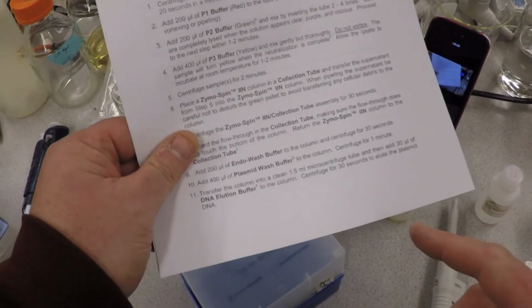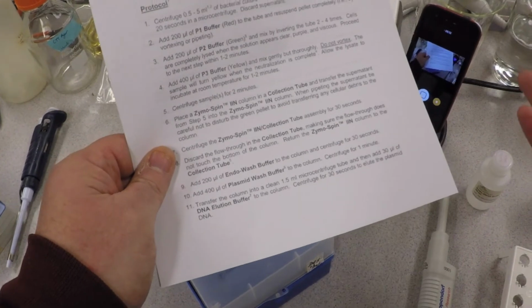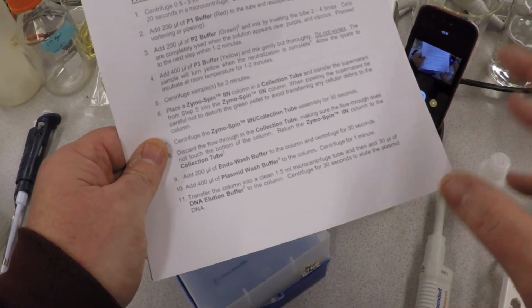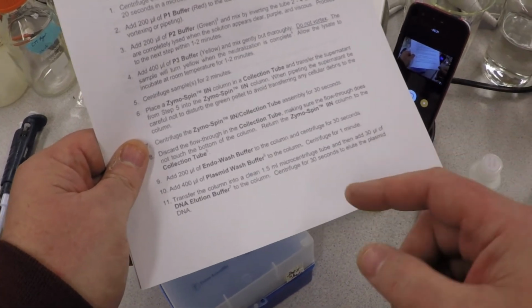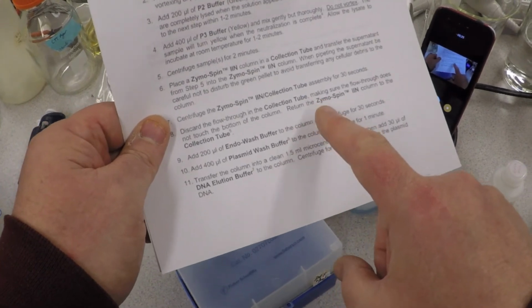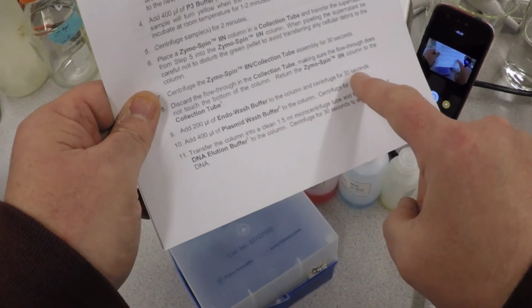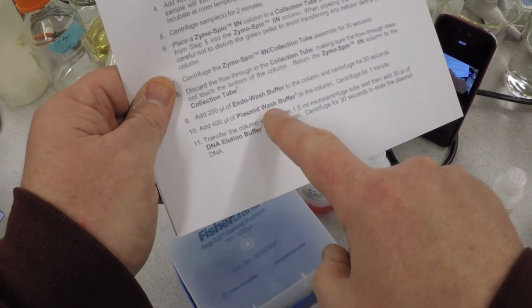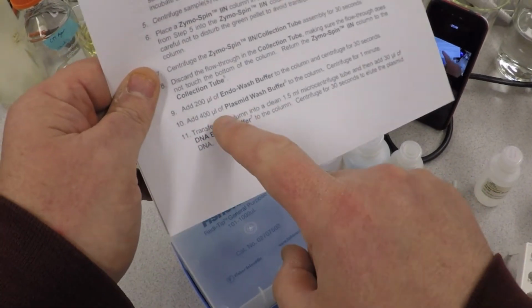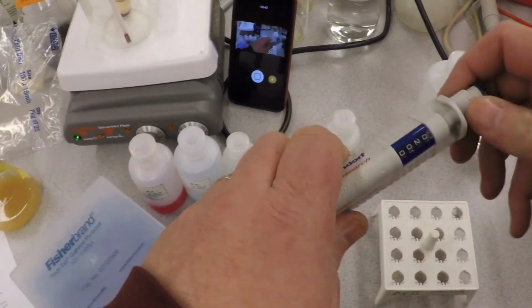So we've lysed our cells, we've denatured the DNA, we renatured it, we've spun out and gotten rid of all the cell debris and nucleic acid, the big stuff, the genome, and now we're washing our pellet. We stuck our pellet, our little plasmid, to that white piece in the bottom of the tube, and now we're washing it, okay? Now it says 400 of plasmid wash buffer, so that's another buffer we're going to wash and centrifuge for a minute. So it's 400 microliters this time. That's 30 seconds about.